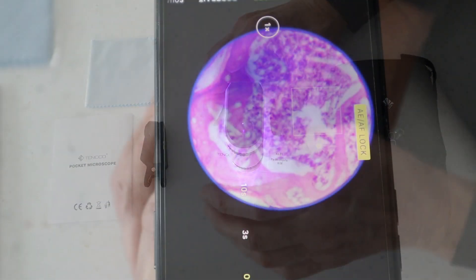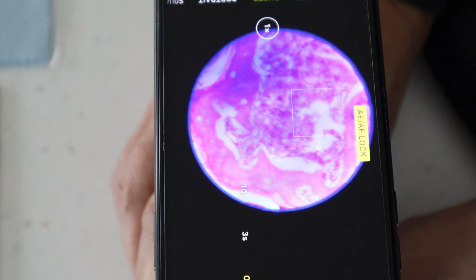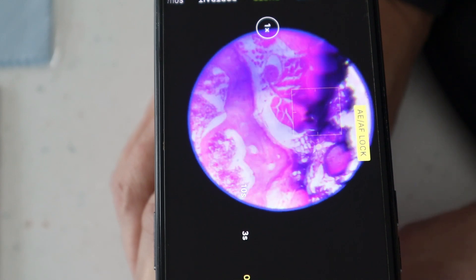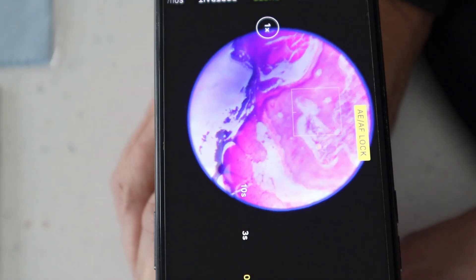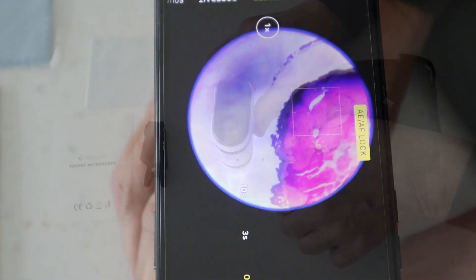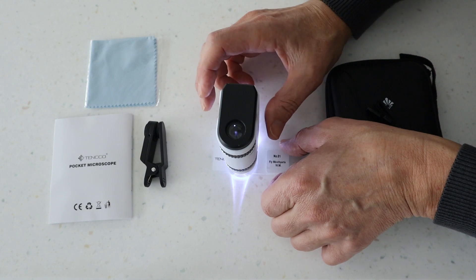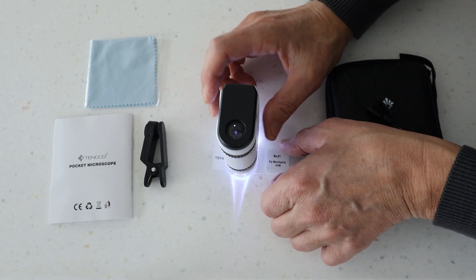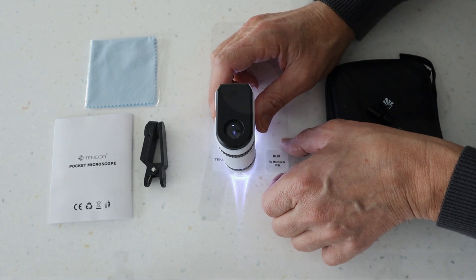I'll be honest with you — I wasn't expecting a great deal out of this microscope, but honestly it's absolutely incredible. The picture is crystal clear, really focusing in on everything on that tiny sample. What I'm going to do is get the phone on so I can hopefully show you that with the phone connected — just to see how good the picture quality is on this microscope.